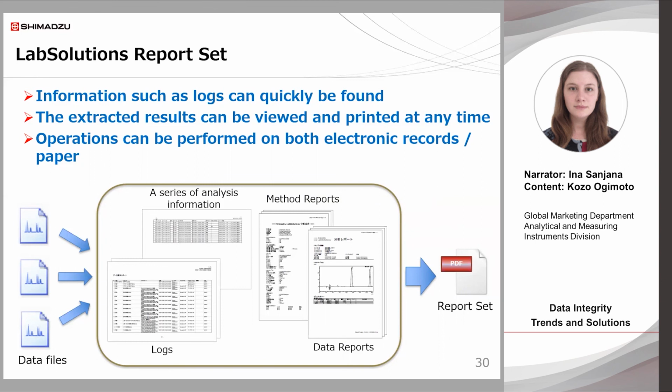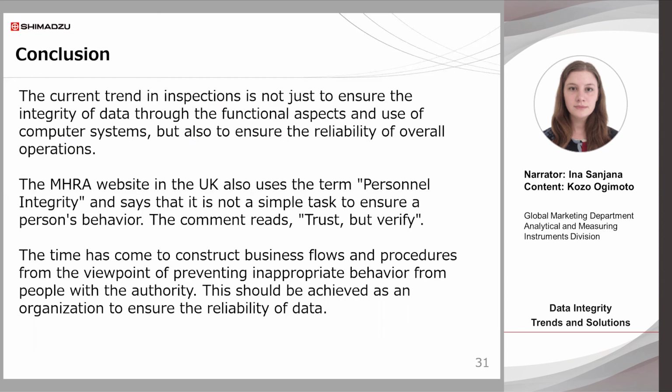It also prints a report of the methods used in the analysis. Lastly, a normal analysis report is printed. A set of information about these selected batches and data, analysis logs, audit trails, method reports, and data reports is automatically extracted and securely stored in the system as PDFs. You can view, print, and review these PDFs from the Report Set feature. In this way, the Report Set feature enables you to quickly and accurately gather the information you need to streamline your review process. Here we come to the conclusion of this talk.